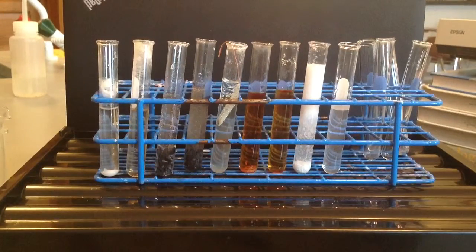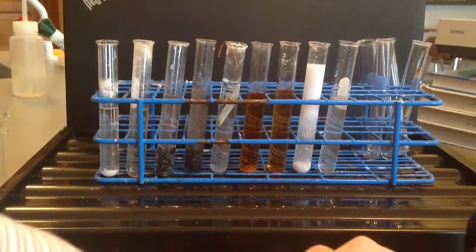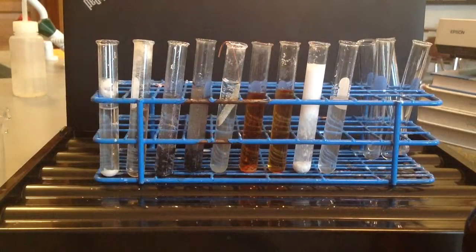Okay, so this is the last one that we'll be doing. This is the second part of step 7, where you're going to be adding sodium chromate to silver nitrate. So I have a test tube right here that already has silver nitrate in it, and I'm going to be adding to it in drops the sodium chromate. And we'll watch and see what happens. All right, and after that, we'll take a look at our copper wire and silver nitrate because that will have been done after 15 minutes.